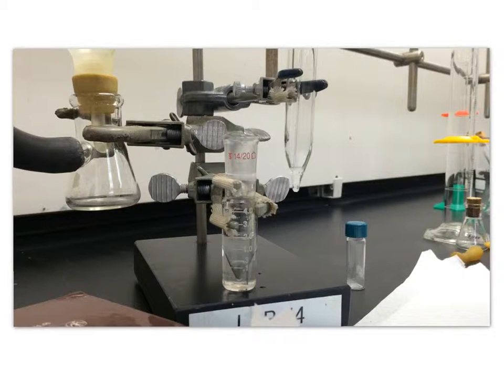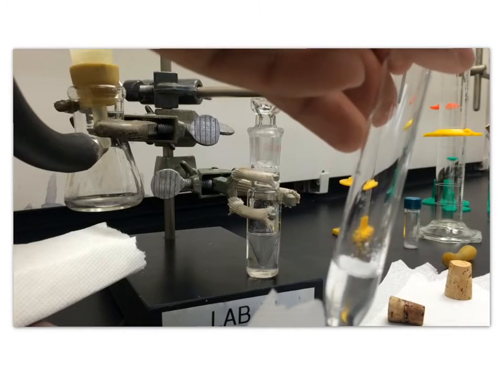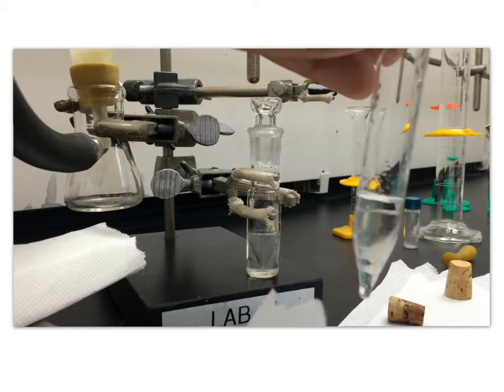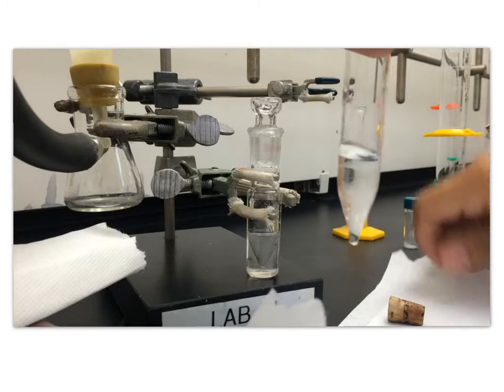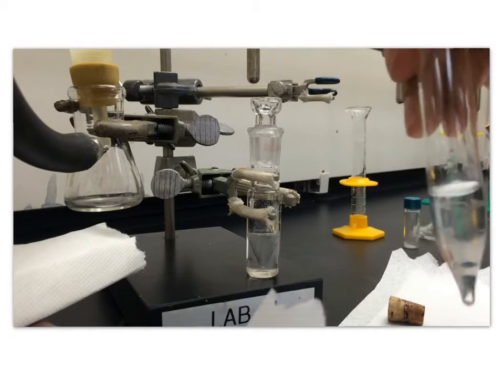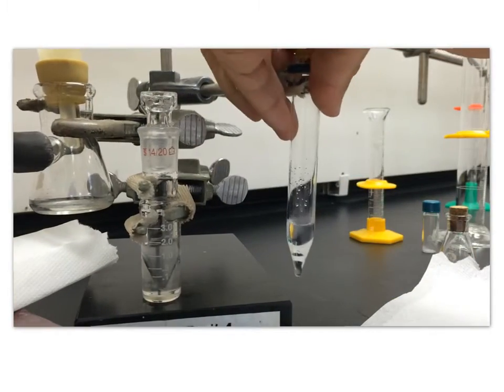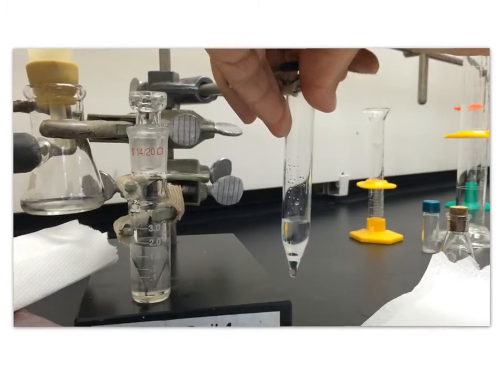In back extraction, the compound is changed back to its initial form, which, due to the solubility rules that we discussed earlier, would cause the substance to show in solid form, or a precipitate. The base, when it was in ether, was soluble because the organic part of the base was much larger in size than its polar end was.